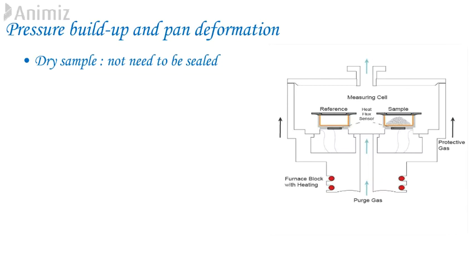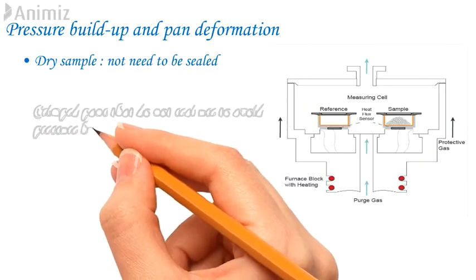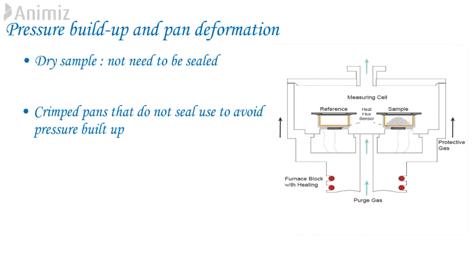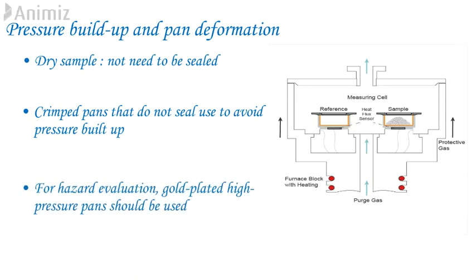Ultimately sample leaks and bursting can occur which usually result in contamination of analyzer. The best solution for such systems is to work with crimp pans that do not seal or use lids with holes in. If crimp pans are not available then it is better to penetrate a lid before encapsulation so that the pressure does not build. Sometimes one hole will block with sample and back pressure will force the sample out of the pan, so it is better to have more than one hole in the lid. For hazard evaluation gold plated high pressure pans should be used since these should be inert towards sample.